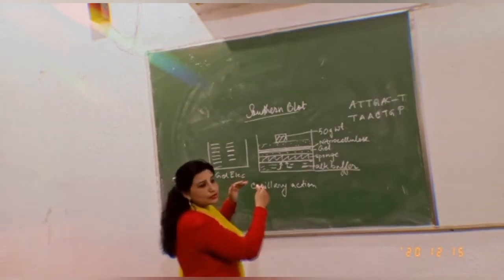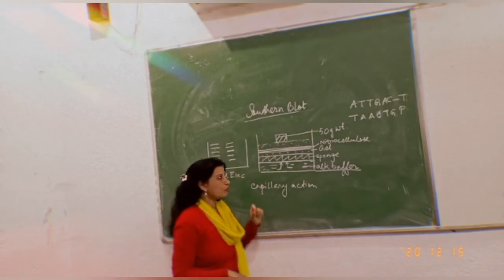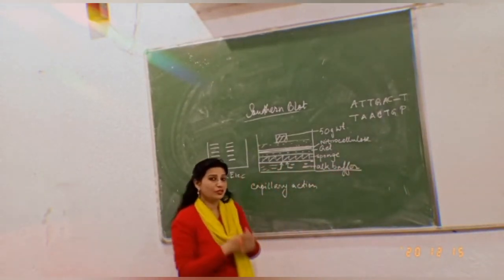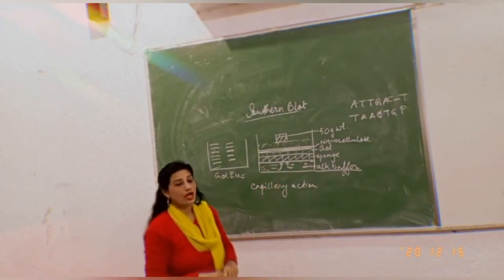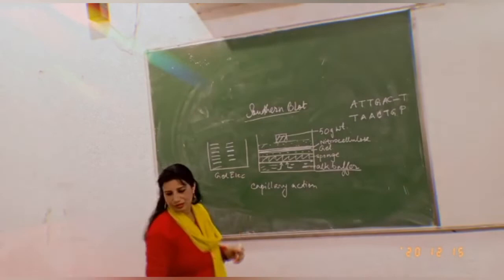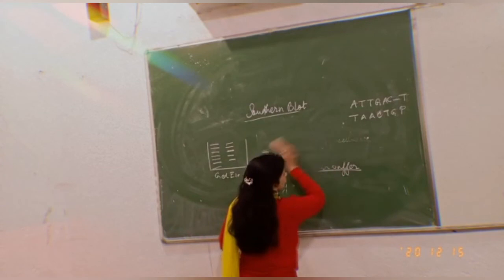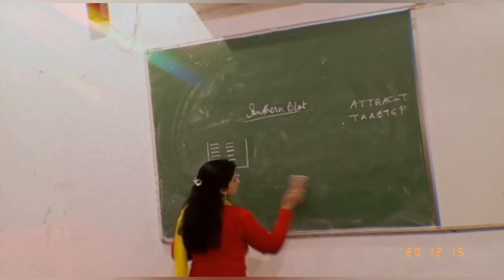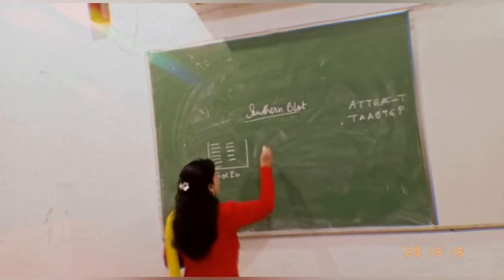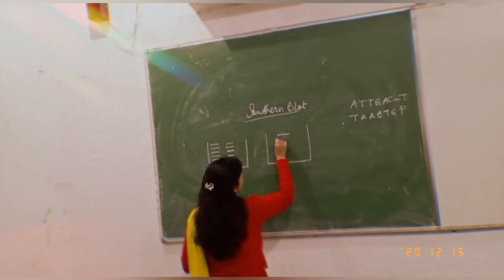The gel electrophoresis method gave me the total band, but at that time I was unable to understand whether my target sequence or target molecule is present or not, and even if it is present, where exactly it is present. So now that I have got an exact copy, I can say that my motive for this experiment through this multi-layered chamber is successful. Now I have got one exact copy, and I have got a band.